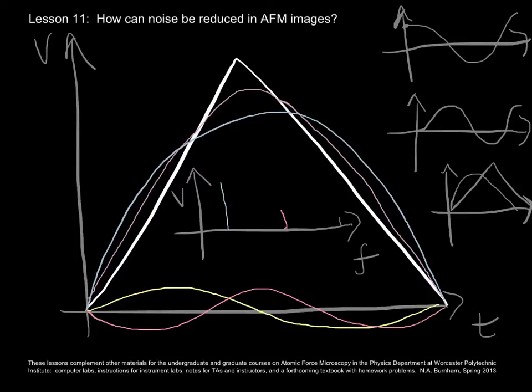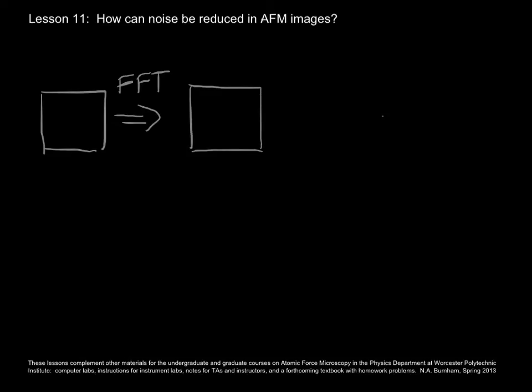So what we're going to do is the following process. There is a 4-step process. No matter which kind of Fourier filtering you're doing, you have your image, you do the Fourier transform, and now, because we're talking about more than one direction, the data are presented in terms of a 2-dimensional plane with 1 over x on one axis and 1 over y on the other axis, and the contributions of those frequencies are denoted by colors.